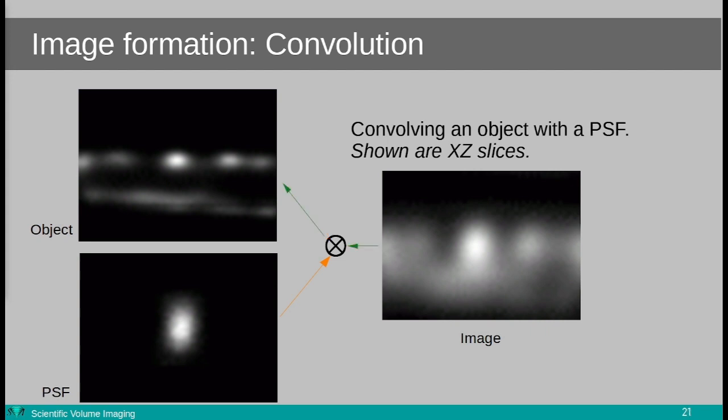Of course, this is a simplified explanation because there are also many other factors such as noise, crosstalk, and aberration that need to be handled during the image restoration in Huygens. But the key takeaway for now is the PSF image.